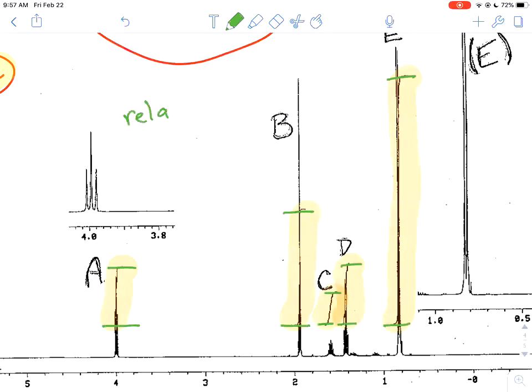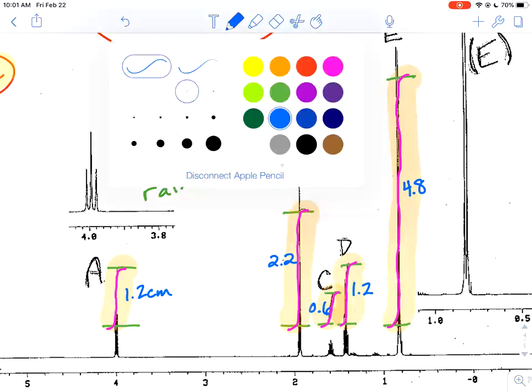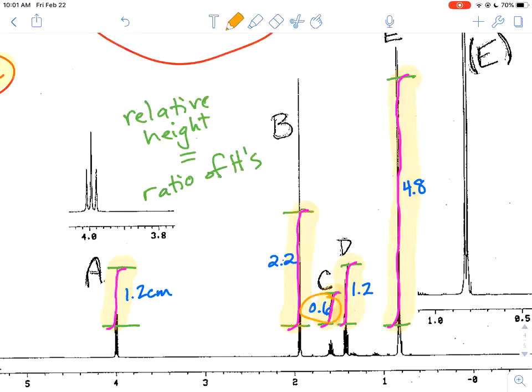So the relative height of each of those peaks to each other is going to be equal to the ratio of hydrogens associated with each signal. Now we already know what the ratio of each hydrogens should be. This is just supporting that. So you can see, I did some fun things here in pink. I highlighted where the integration lines actually were. And then I went ahead and measured on paper, not on the screen, because the scale is important. Yeah, I gave the heights of each of those pink lines from the green to the green. And so what we want to look for is the lowest value. And in this case, the lowest value is 0.6. And this is going to relate to, in our case, one hydrogen. We already have some information. We know that there is a single one hydrogen signal. So that's going to be our stamp or our beginning point for a relative ratio. We divide each one by 0.6.